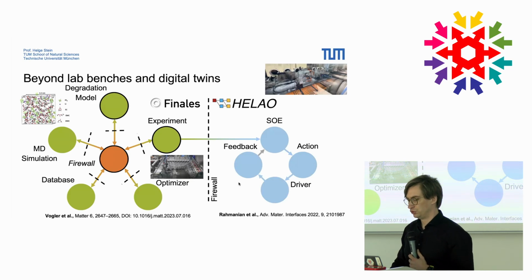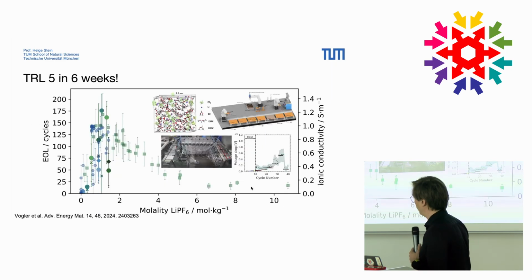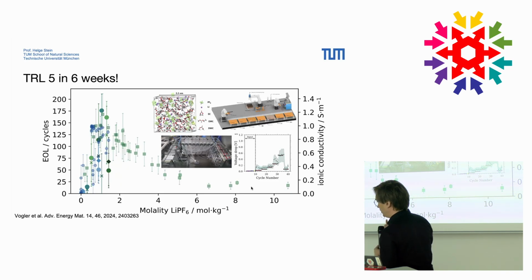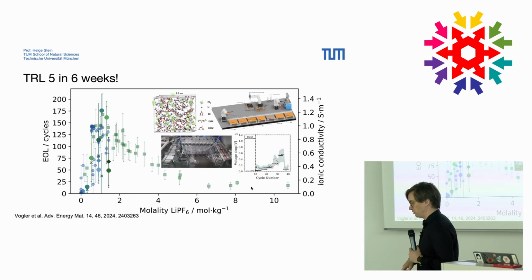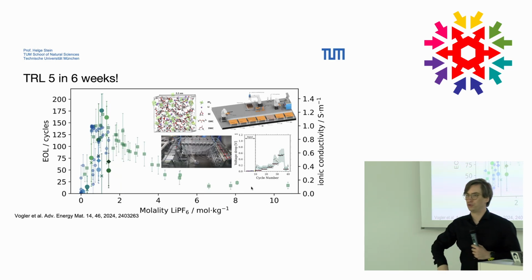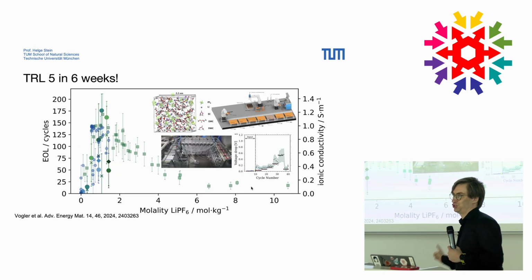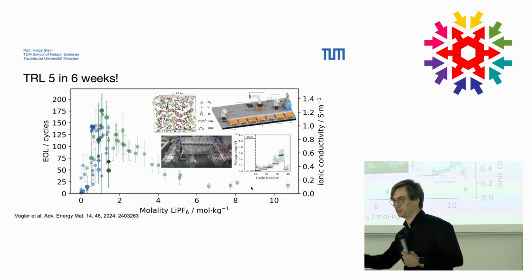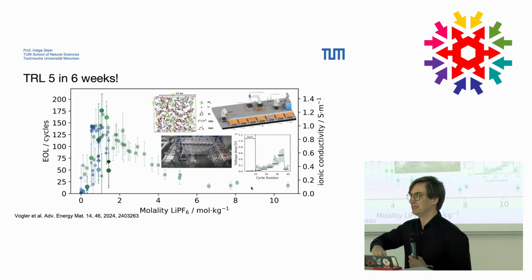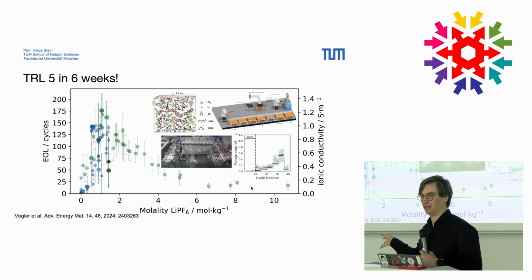So usually it works. What we used this for was a workflow where we really wanted to show that this is intention agnostic. So what does intention agnostic mean? Typically, you set up a workflow to do one thing and one thing only. What I really wanted to show here is, hey, I can do 2 things at once, because if I can do 2 things at once on the same hardware in the same kind of workflow, then I can also do 3, 4, 5 different other things.